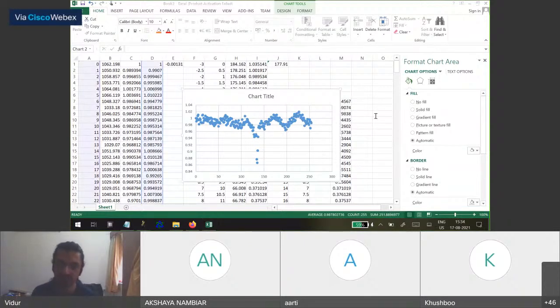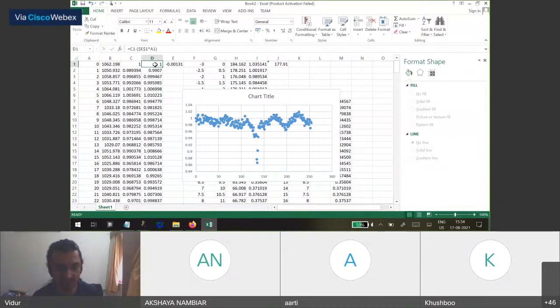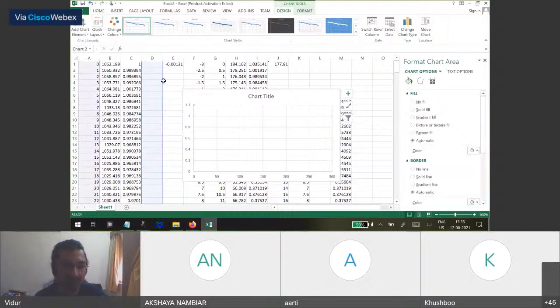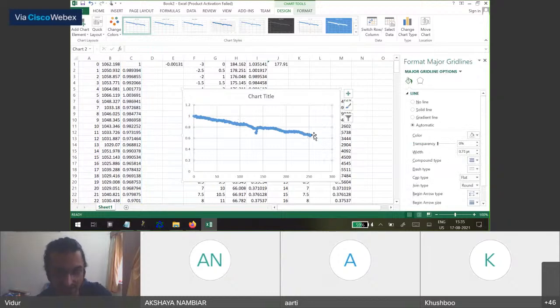Okay, Kajil, this is not something that you need to do. It's just something to understand why acquisition bleaching is important. I'll go over the explanation again. If you have any intensity like this, acquisition bleaching, which is reducing with time, you have to correct for this loss in intensity somehow.